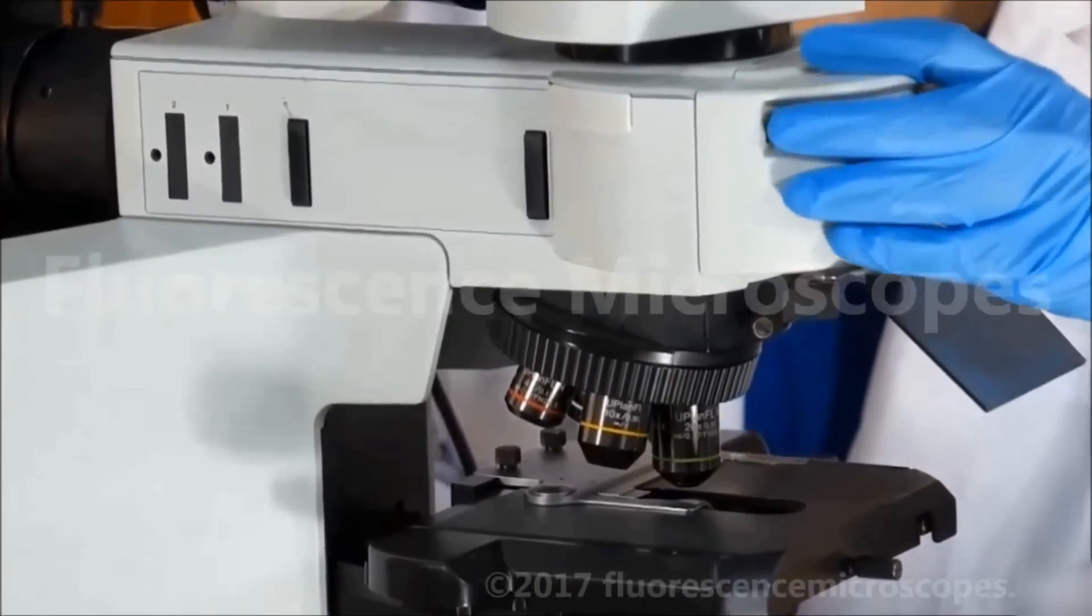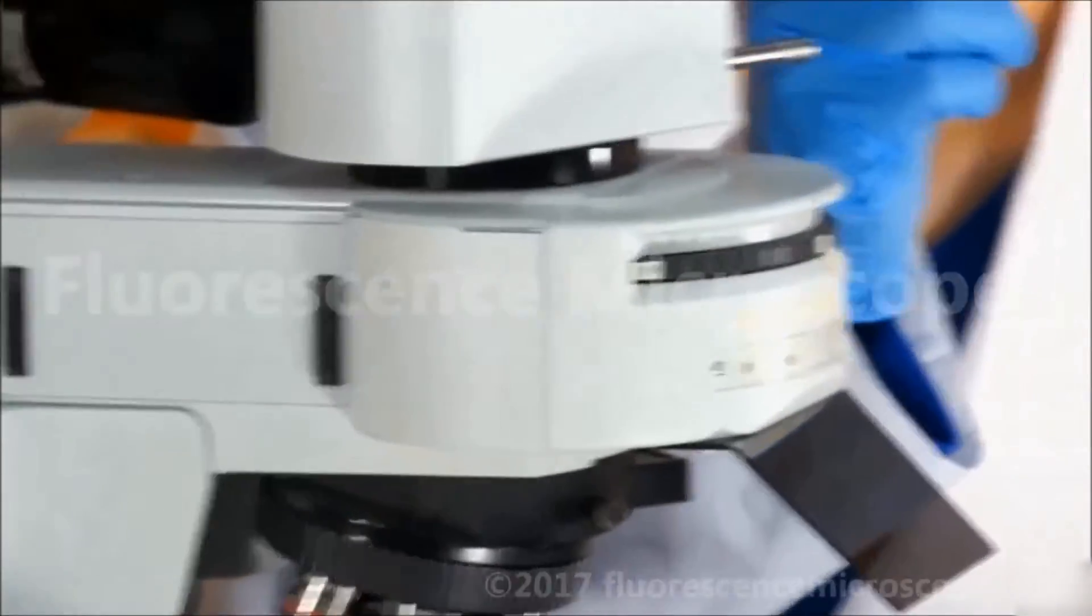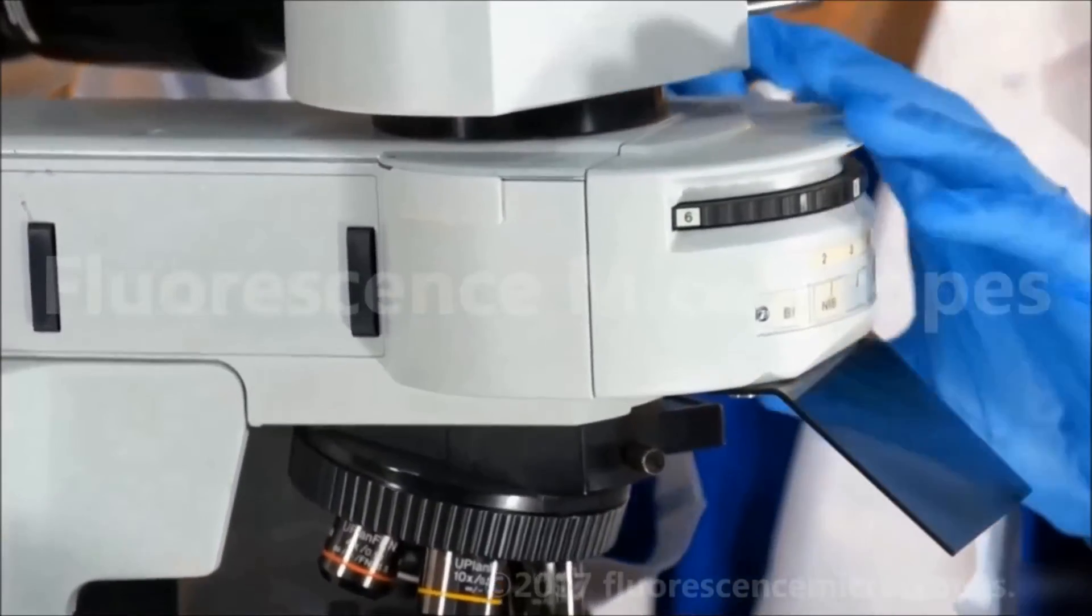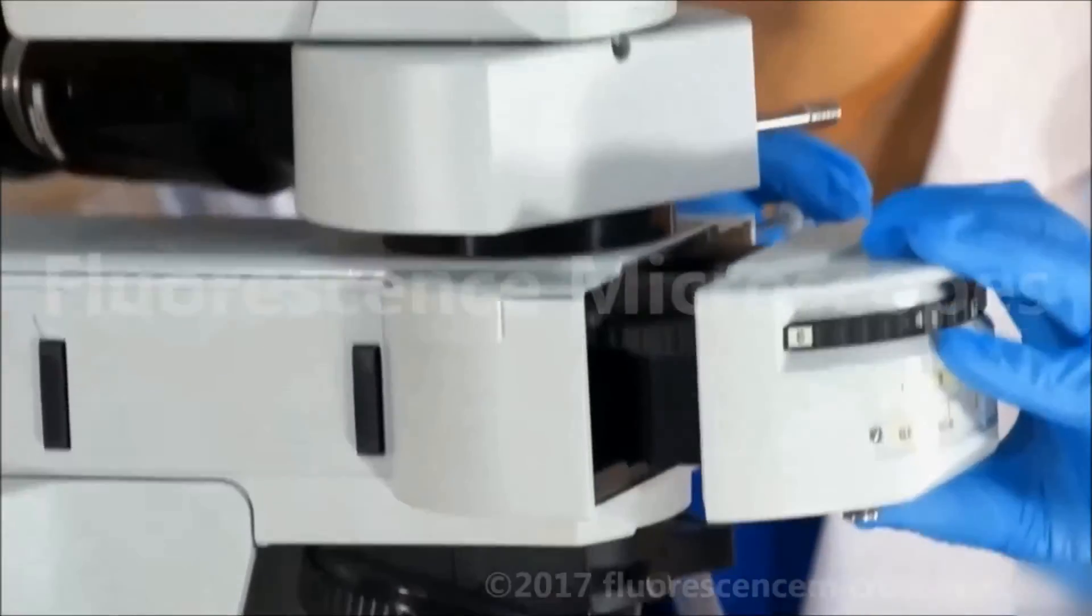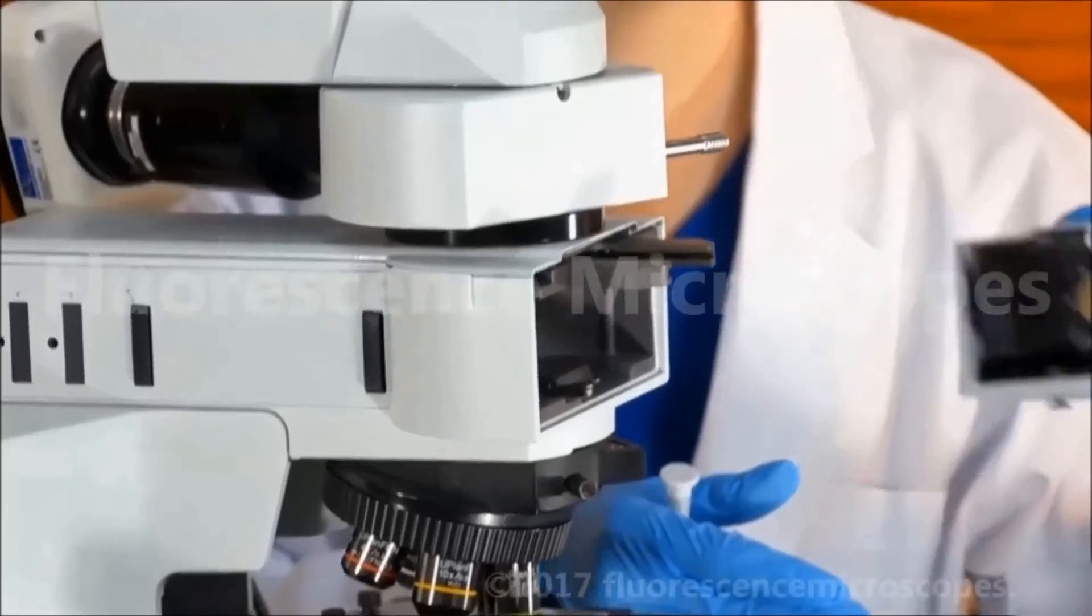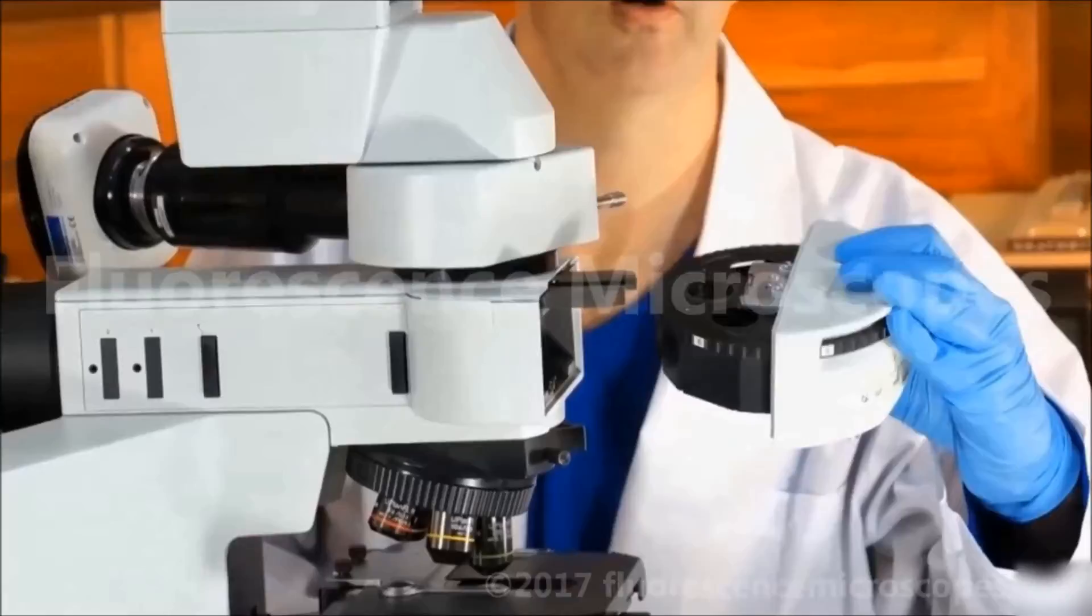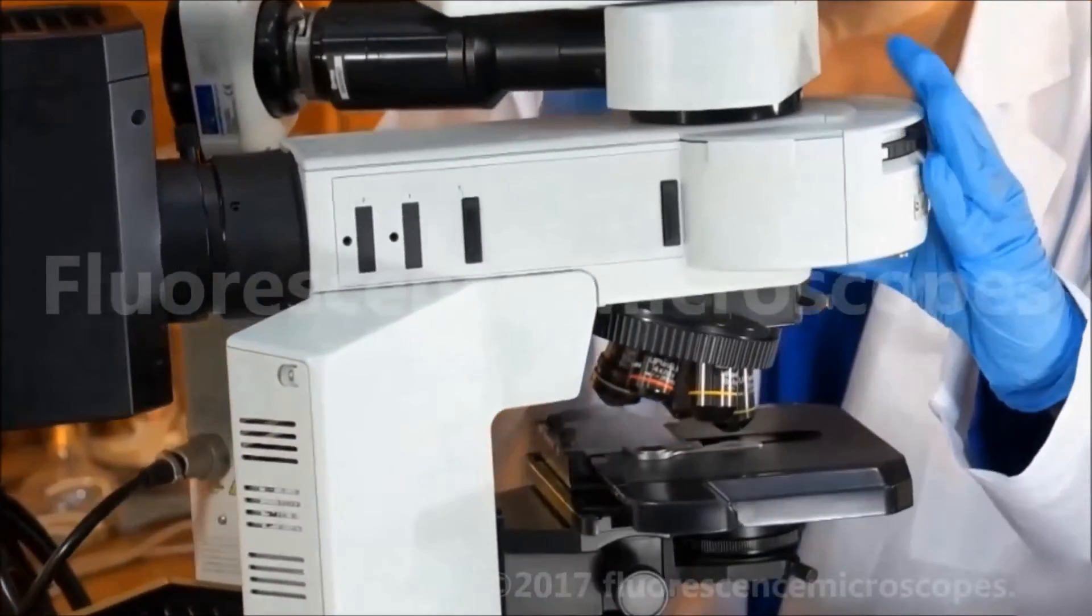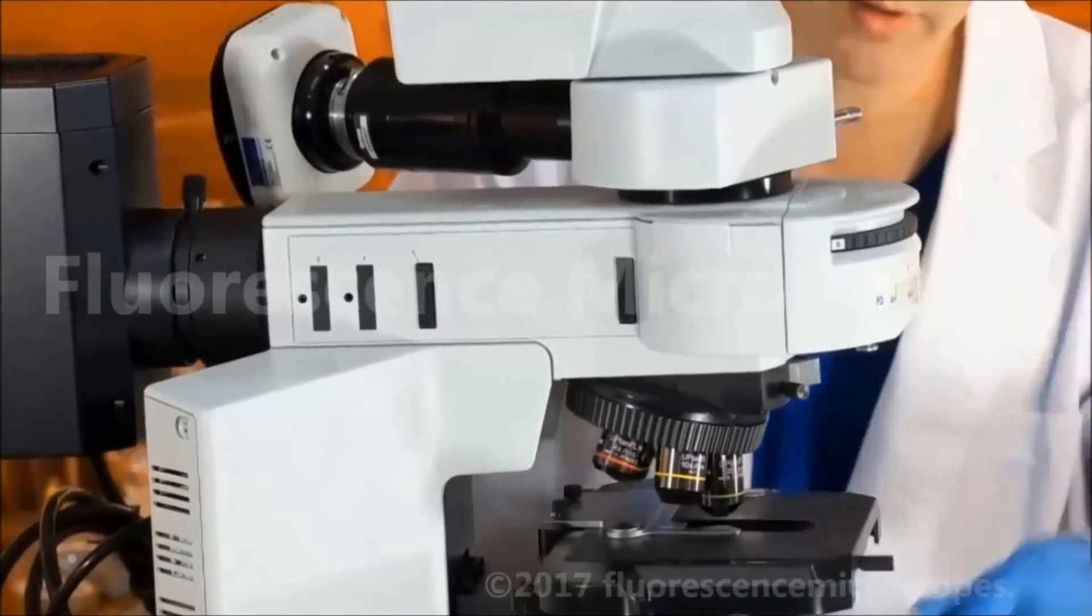The reflector turret is inside. I'll take the included 3mm hex island head wrench. This is an original Olympus. We can see what filters that we have. We can configure your filters however you may want. If you want other filters than what's included in the ad, just let us know. Everything is customizable.